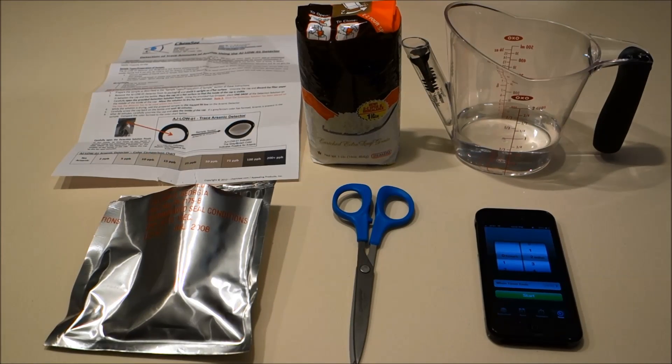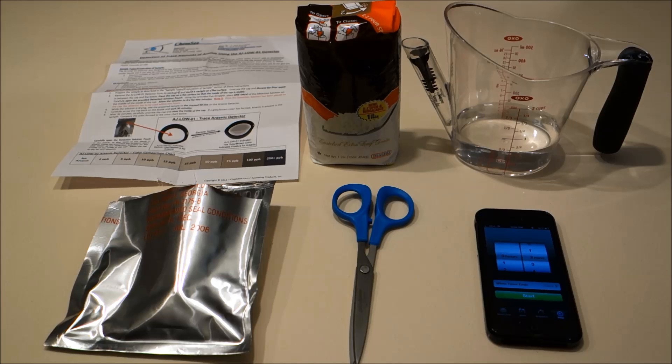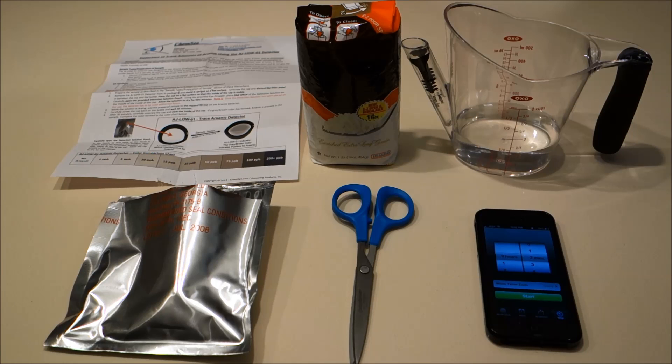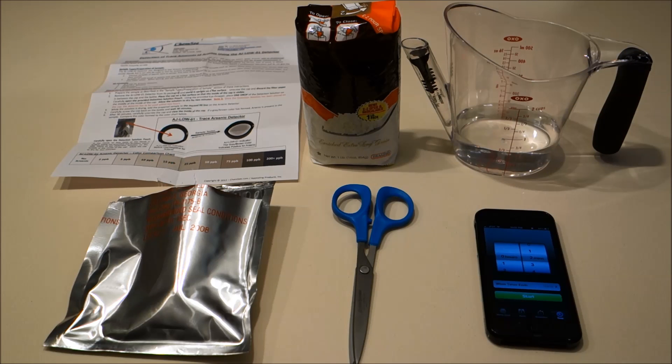Hi there. Today we are going to test for arsenic in rice using the TestSafe arsenic detector.